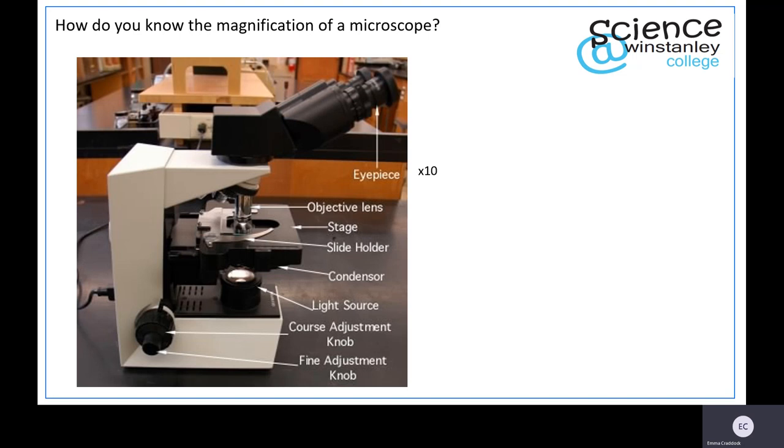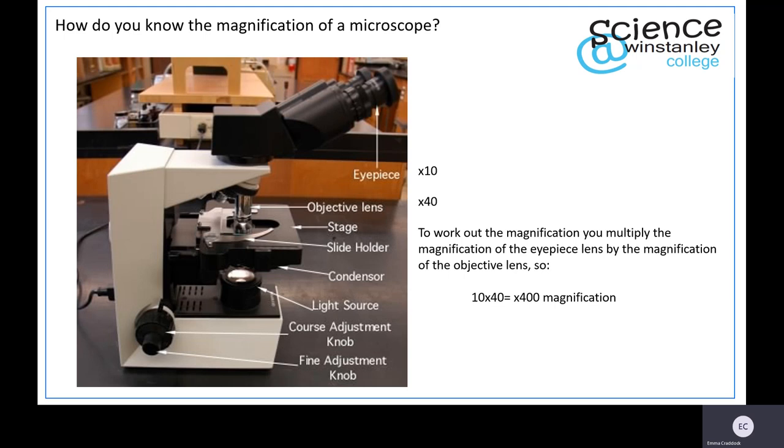You then find the magnification of your objective lens. On this particular microscope it is times 40. To work out the magnification you multiply the magnification of the eyepiece lens by the objective lens. So for this microscope it is 10 times 40, giving you times 400 magnification. This means your image size is 400 times bigger than the actual size of your object.